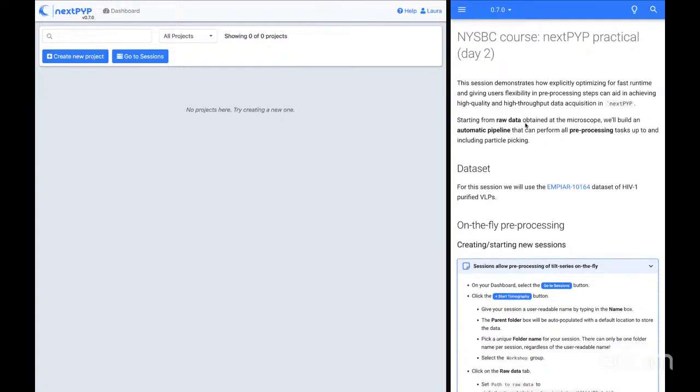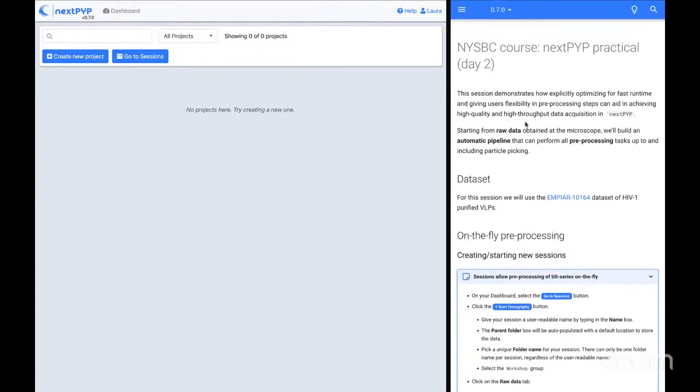So maybe we need to clarify that you guys will not be able to follow what she's doing, because of the way the resources are set up on the sessions, we have no control on how much resources each of you can use. So that could overload the system.